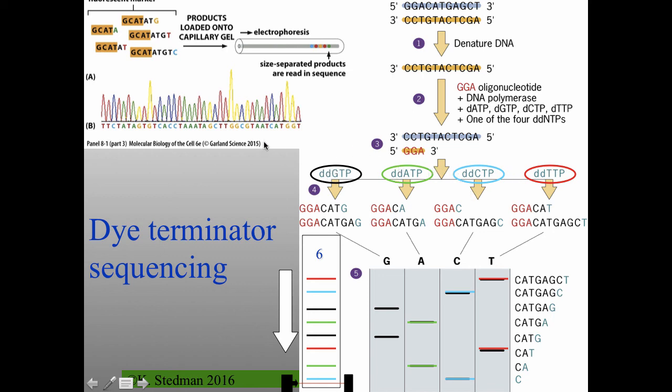And again, this is that big advantage that DNA polymerases can add stuff that's got extra things hanging off the end. And so here, G is black, A is green, C is blue, and T is red. This is the way it would look on a normal four reactions. You can compress all of these things together. You end up with a whole stretch of just different colors, and all you need to do is read what those different colors are.